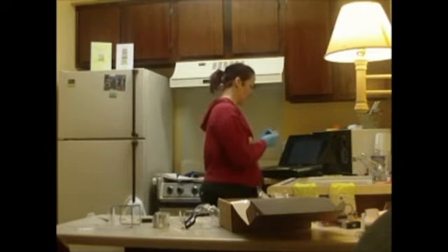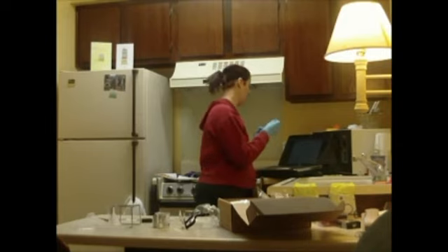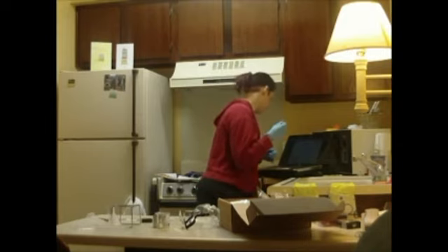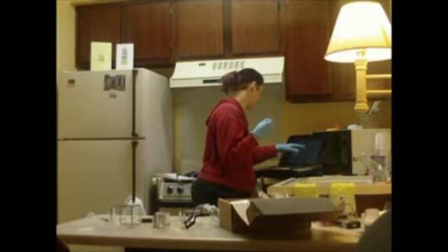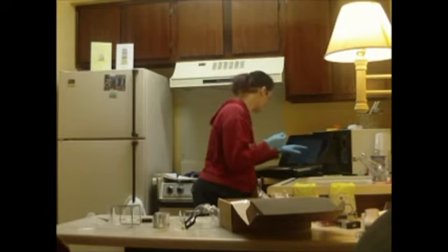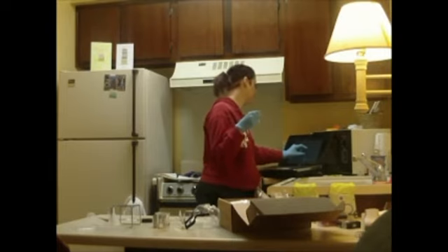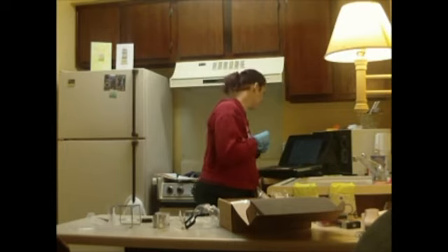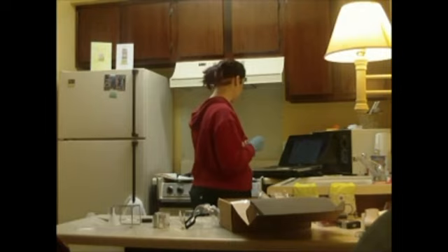Maybe they're just referring to these, the fact that these are in the pipettes. Yeah, sodium hydroxide and the hydrochloric acid. Okay, it's just listing them separately, I guess. One saying that they're in 4 milliliters in a dropper bottle, and then sodium hydroxide in a dropper bottle. That's just empty. There's supposed to be 2 empty ones. Okay, well, it looks like sometimes it's wrong. I mean, it also said that I had 5 test tubes.